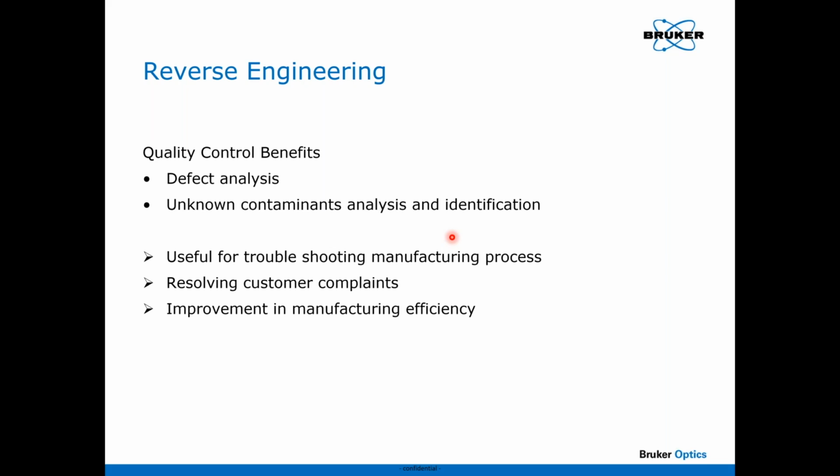And one of the things that we're most interested in looking at when we look at our objects is to figure out what was used by the artist, so that we can best conserve and maintain the integrity of those amazing objects. So we're reverse engineering those as well.